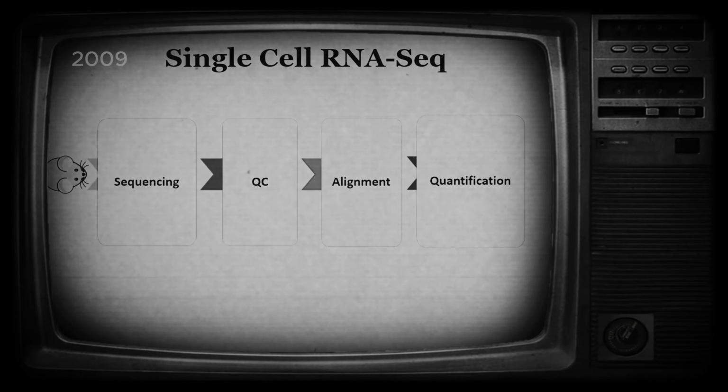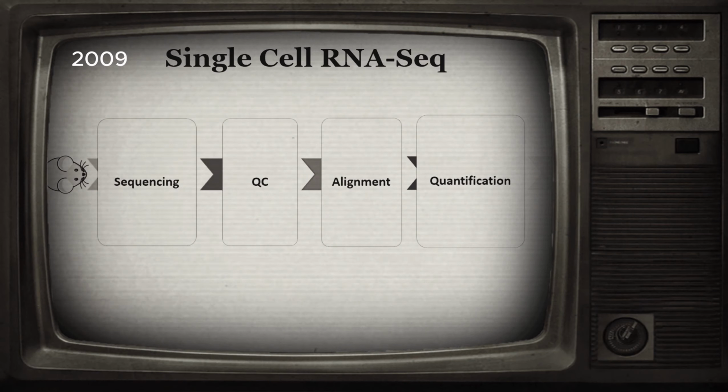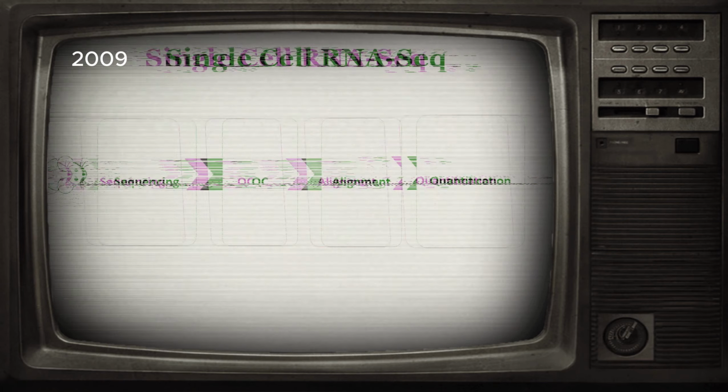Single-cell RNA sequencing analysis was first introduced in a study focused on transcriptome analysis of mouse blastomeres. The study used a modified version of the SMART-Seq2 protocol to perform single-cell RNA sequencing on individual cells.